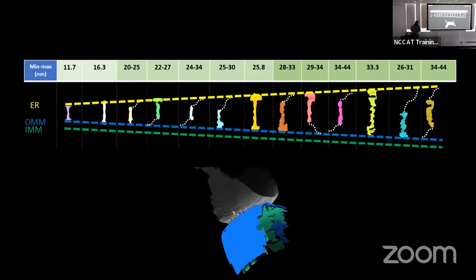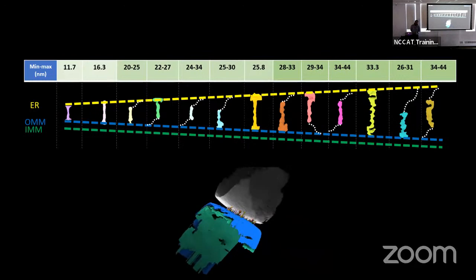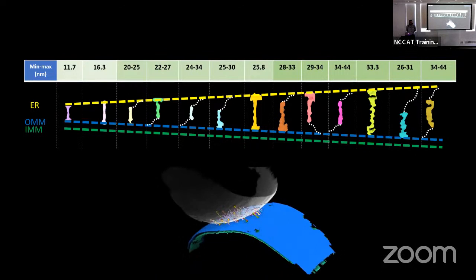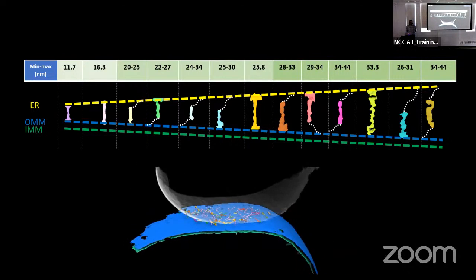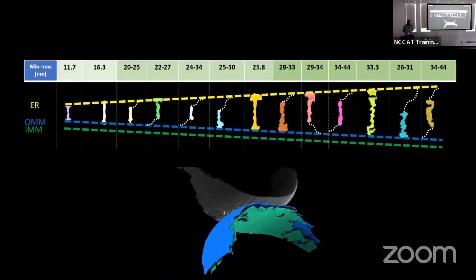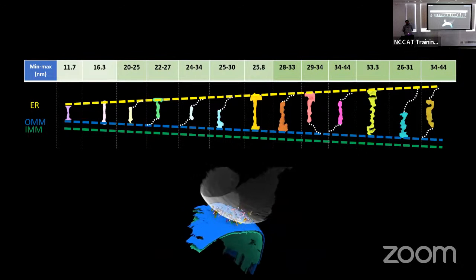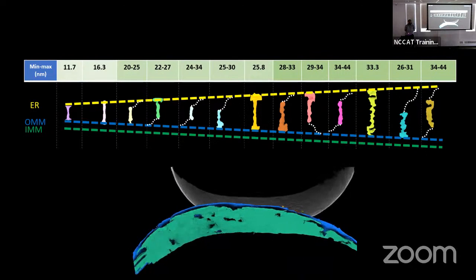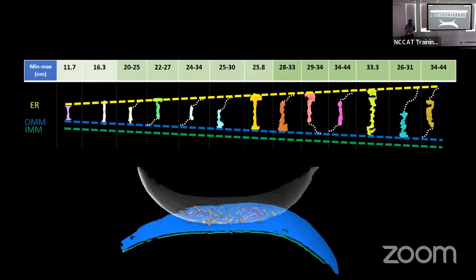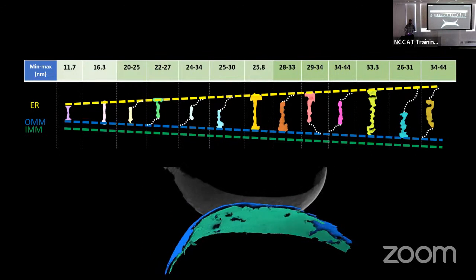Sorry, what's that? Picking it in IMOD also gives that directionality? Oh, I don't know that. Is that a tool in IMOD? Okay. Oh, I didn't know about that. Probably the same. Yeah, all you need is some directionality. And then it sets angles. And if you align them all to Z, basically the Z direction is your reference model. So you just align all of them to Z.